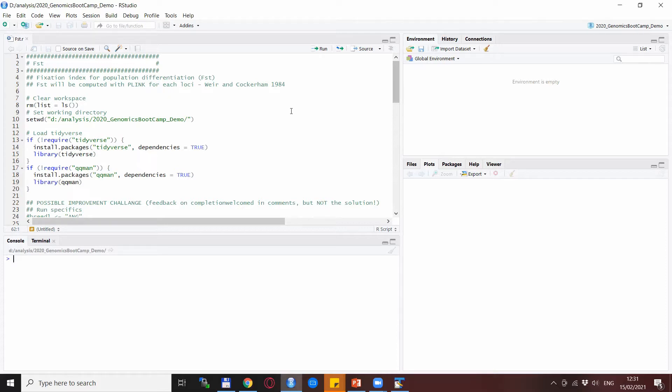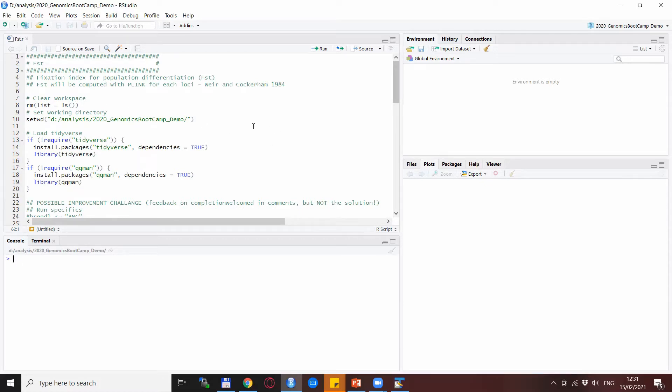The start of the script is rather straightforward. We do the clearing of the workspace as usual and setting of the working directory as usual. Of course, this is my working directory; you need to set it the same as you have the data in your computer.